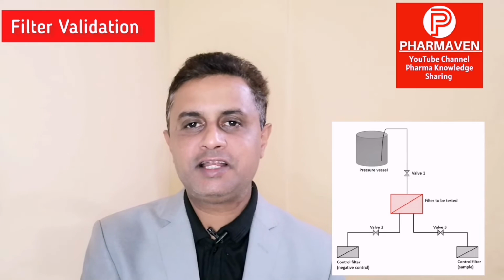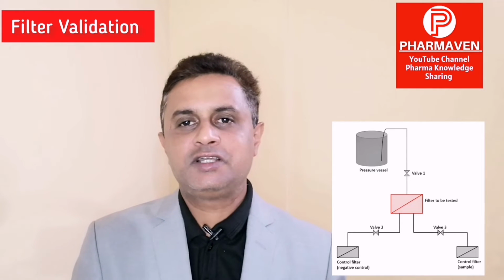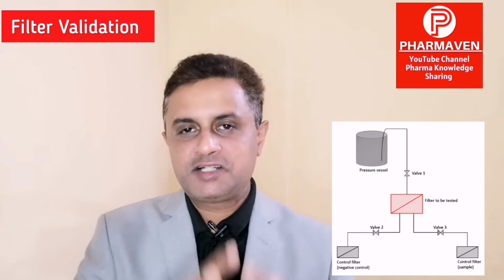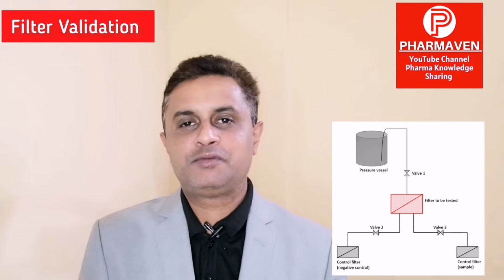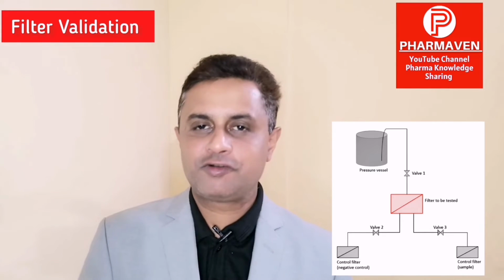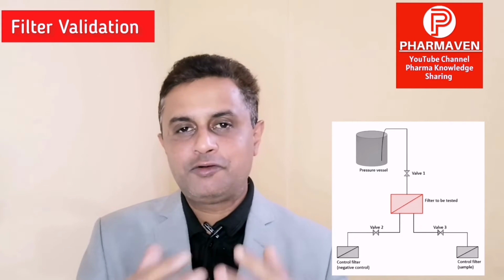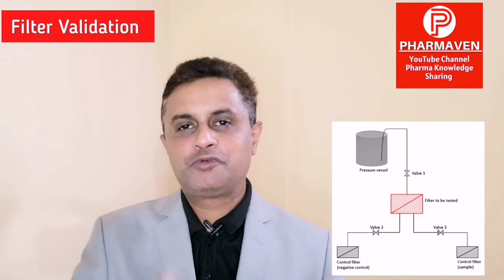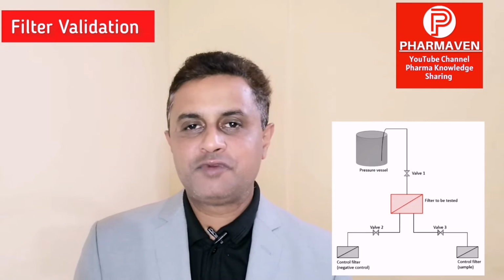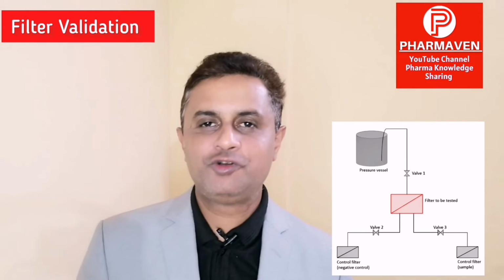Once this is done, then incubate the negative filter in the culture media. This is to ensure that there are no organisms present in this entire sterile setup. If bacteria are already present, then the test will not be valid. So we have to incubate the negative control to prove that this entire assembly is sterile. Once you pass this saline buffer, next is my actual test.